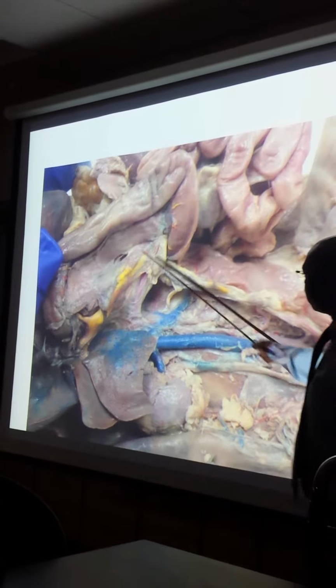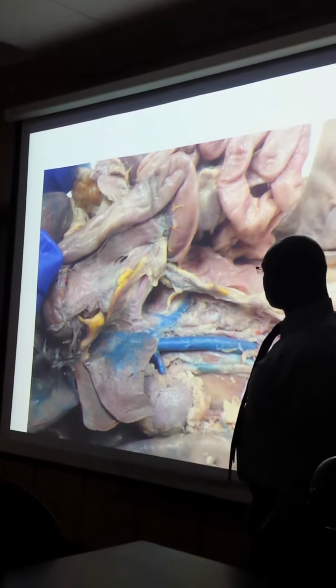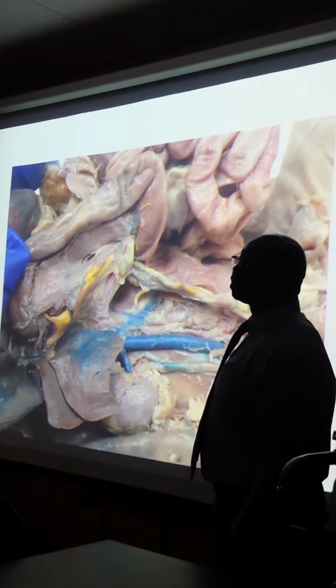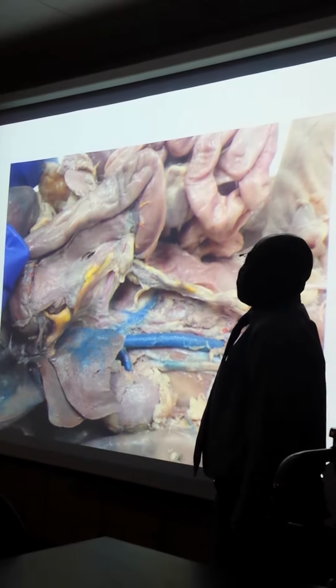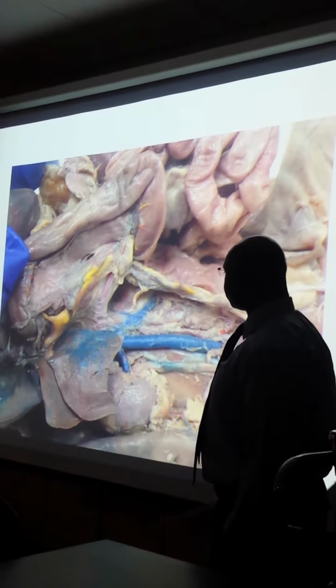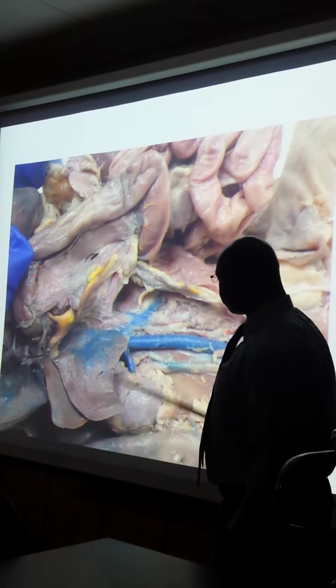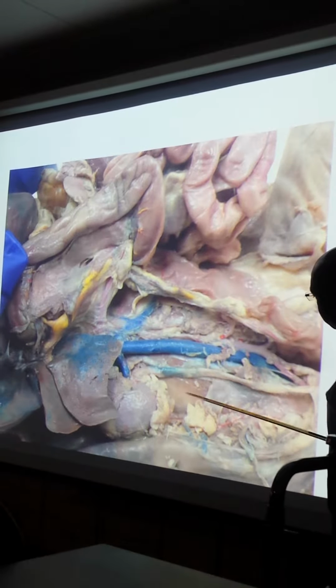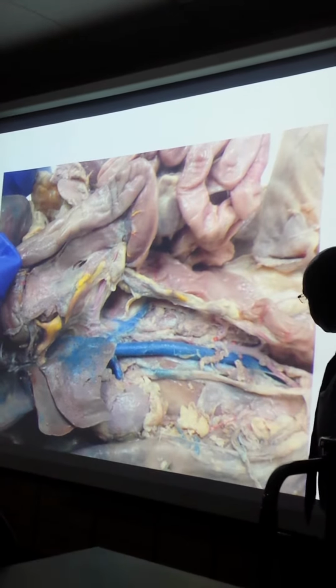Where? Right here. This big fat one right here. And then, of course, inferior mesenteric vein. I have better pictures. I'm just going to go through every pic so you kind of see everything, and of course, the renal vein, and the inferior vena cava. This is the ureter. It's kind of tainted a little bit with one of these blood vessels in the area.